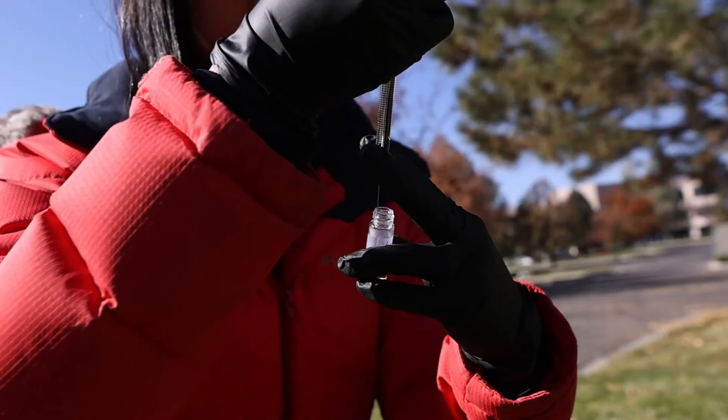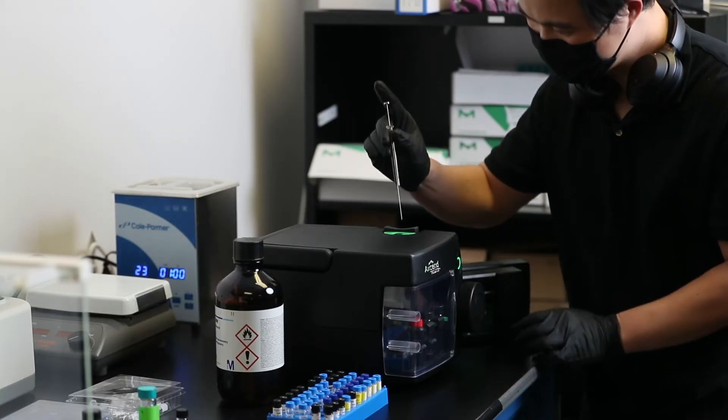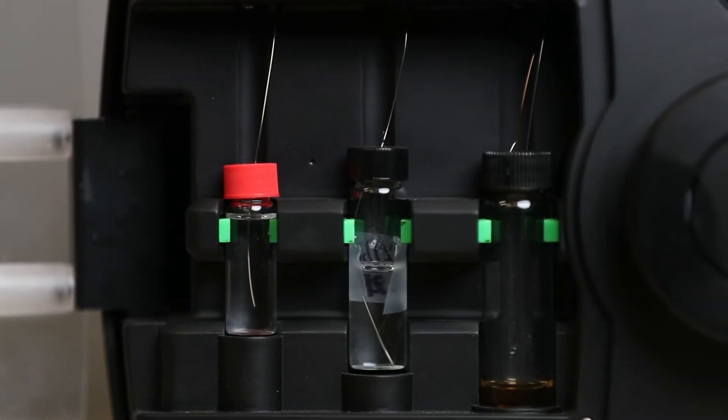For single sample analysis or true field use, there is a protected injection port on the top of the instrument. Alternatively, for multiple successive runs in the lab, the injection valve can be plumbed directly to and integrated with any number of sample handling systems.